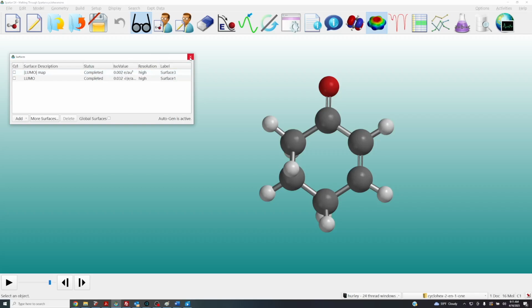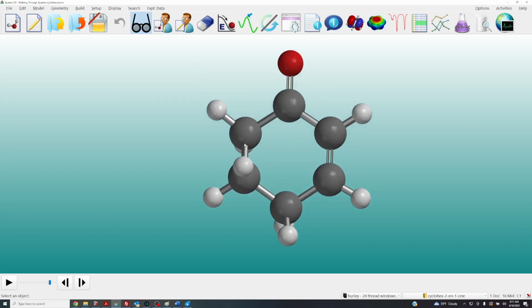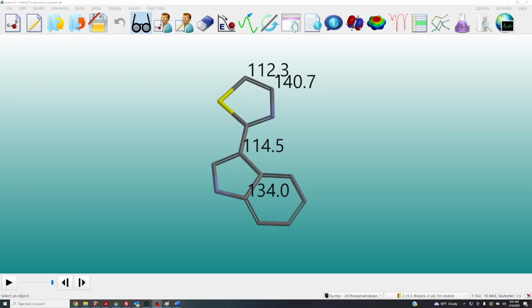Okay, now let's look at the remaining 2 molecules in the list file, which fall under the NMR heading. So the next thing I'd like to do is wrap up with a number of items.